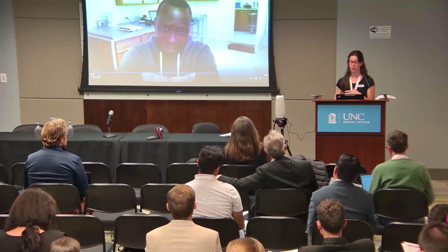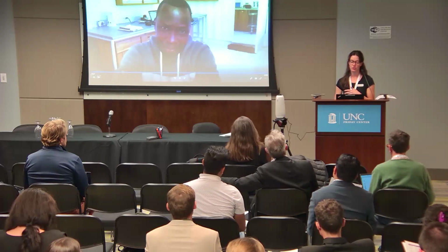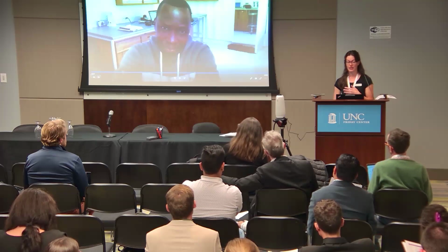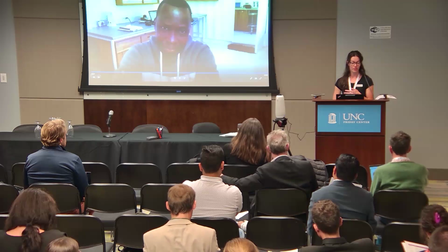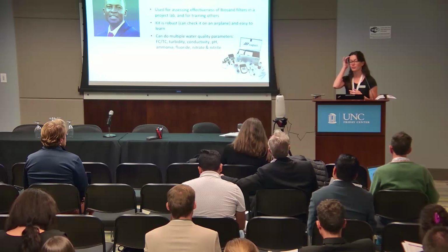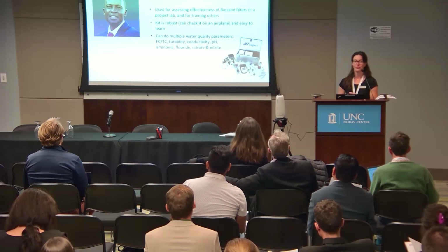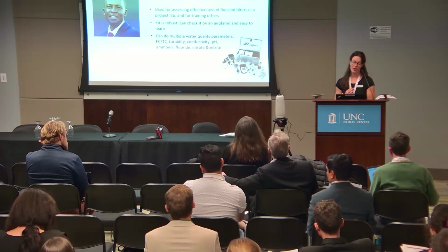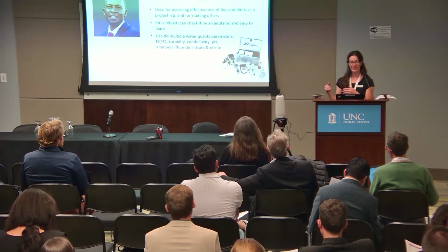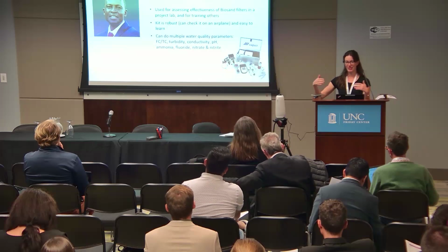So they don't only do microbiological testing, they also look for conductivity, pH, ammonia levels, fluoride, and nitrate. That was one of the reasons why the WagTech kit was appropriate for them and worked for them. And then as well, the fact that the kit, so this was like the old school WagTech kit that came in a metal container.